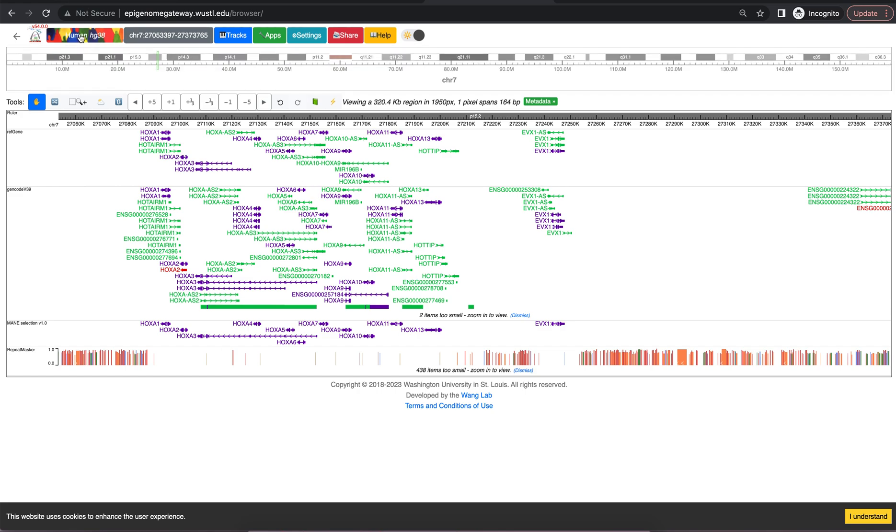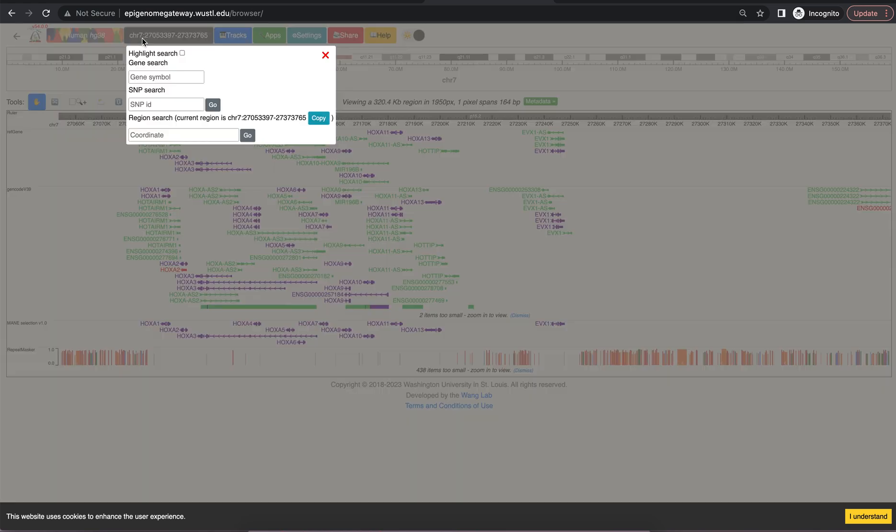You can see the species and the reference assembly in the top left corner. Beside that is a way to navigate using a gene, a SNP, or a region.